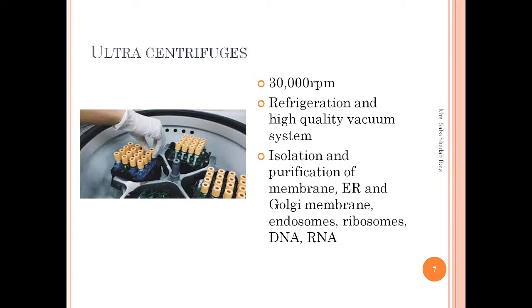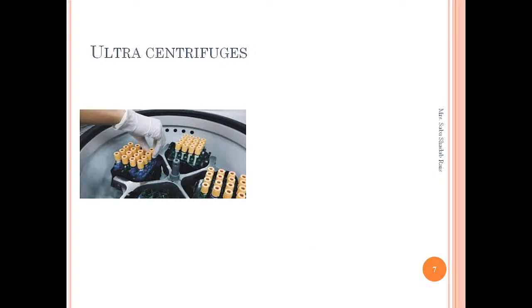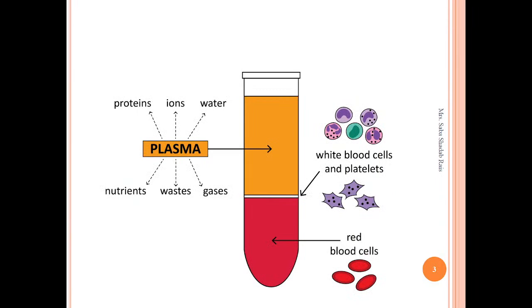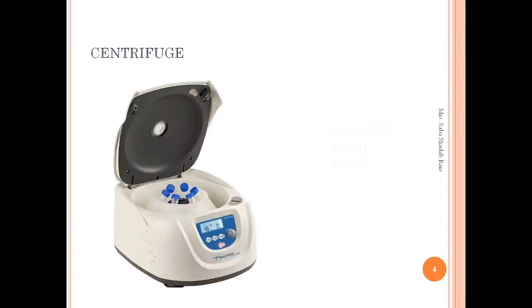Okay, Fatima, we will revise the centrifuge machine, but this revision will be very quick. We learned that the first clinical centrifuge machine was made for separation purposes. Gustav de Laval is credited with creating the first centrifuge machine, and he made it for the separation of cream in the year 1894.